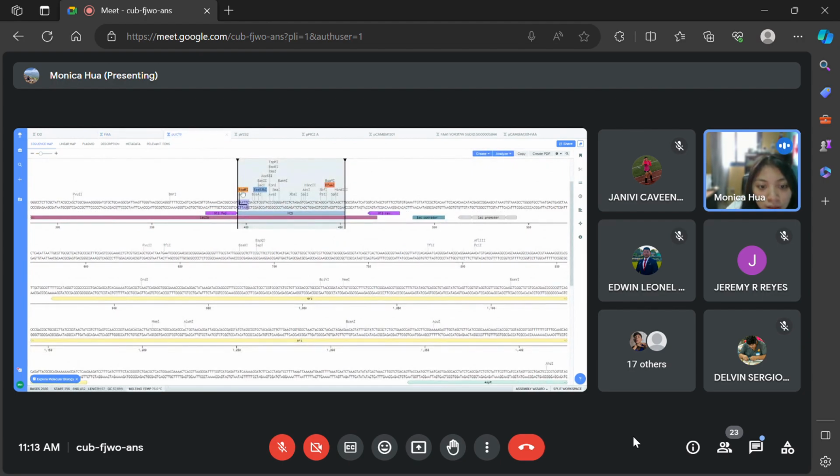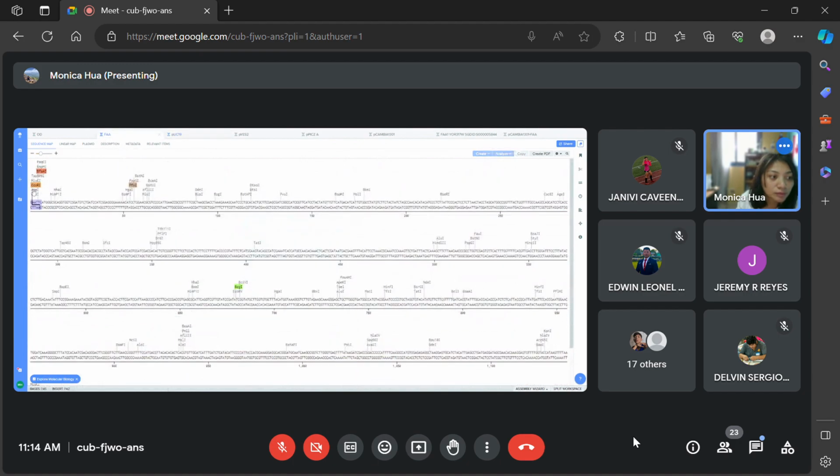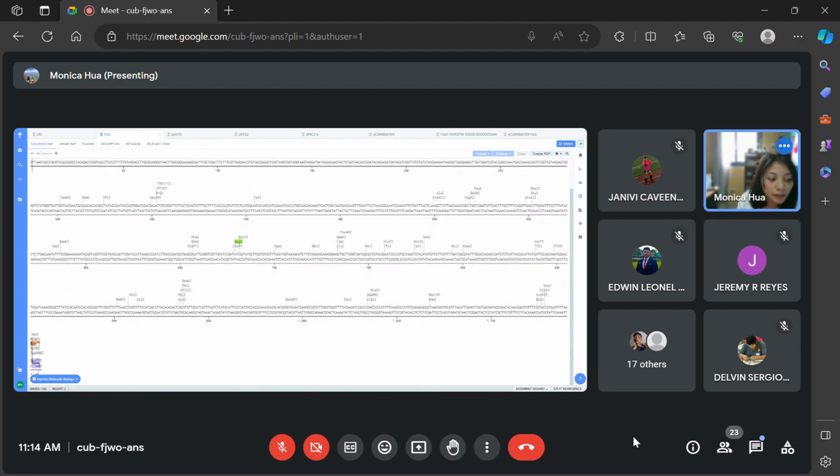Just going to be before ATG. Yeah, okay, that's fine. All right, so you're going to put behind, okay? So before and behind it.